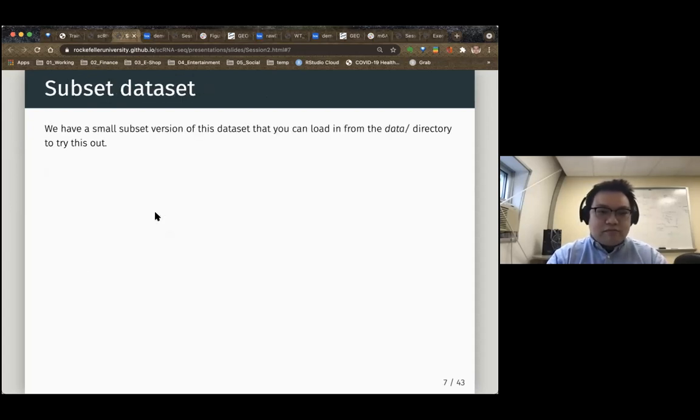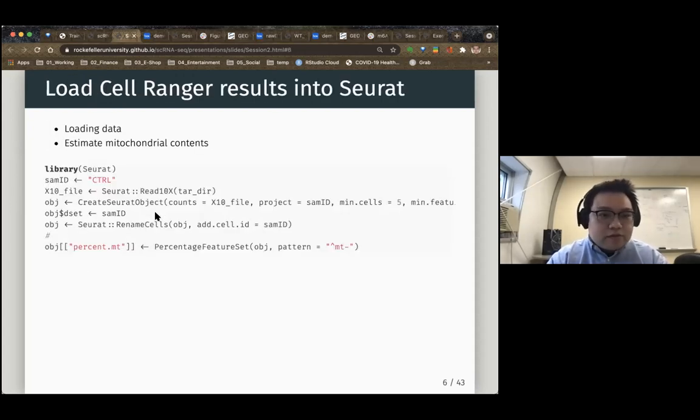And then we will make an additional label, like this data set is the control. If you have multiple data sets, you must assign your data set when you create the Seurat objects. And this is for renaming the barcode. Renaming the cell barcode is not necessary; it's optional.